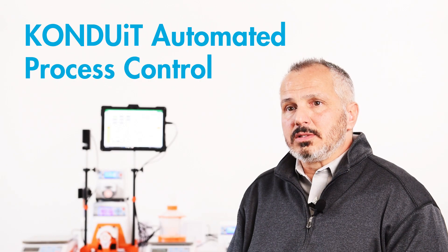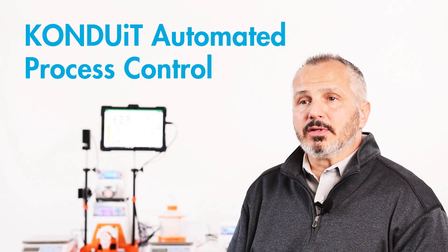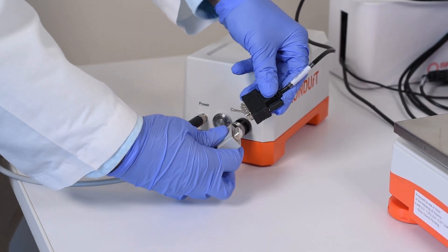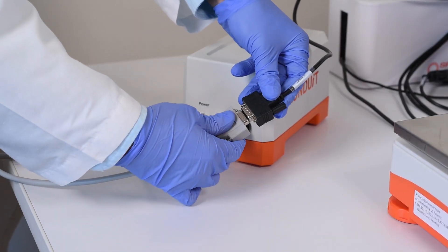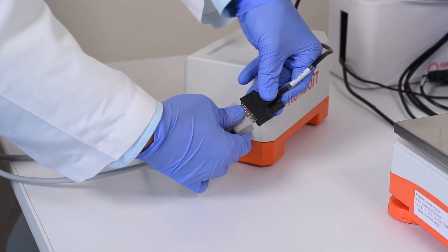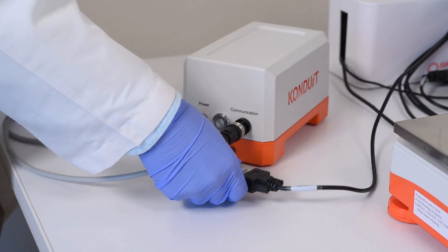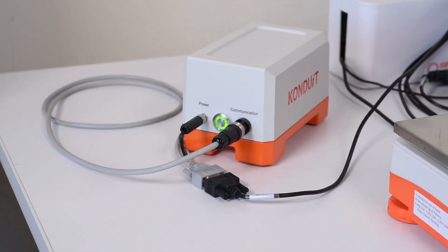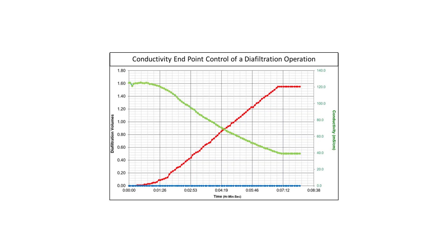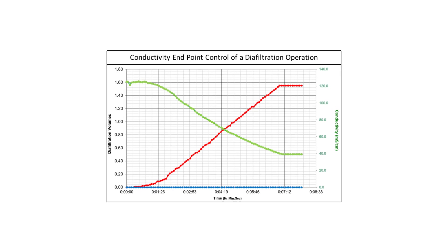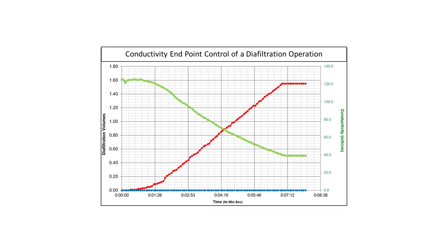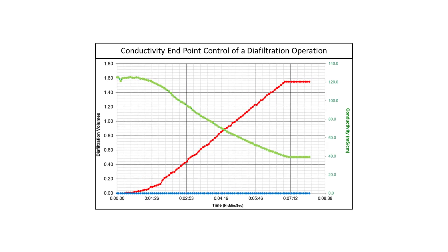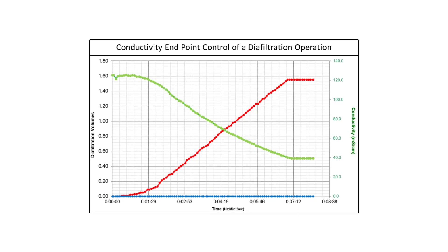The conduit adds additional benefits to the KR2i system. This auxiliary component provides feedback on both conductivity of the process stream or permeate stream, as well as temperature of that stream. It also has the ability to run up to two UV meters — both UV A280 as well as A260.